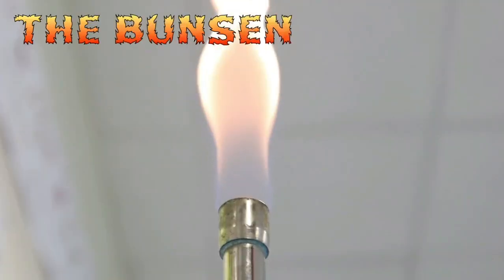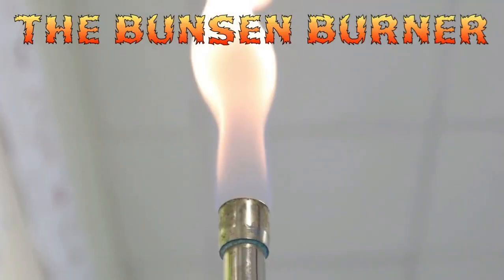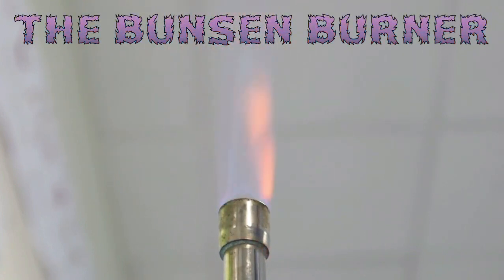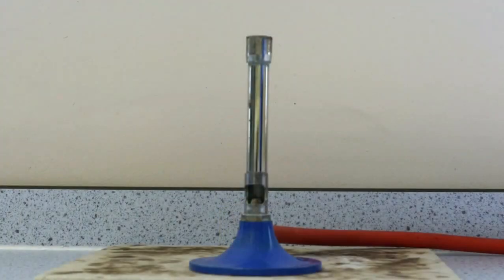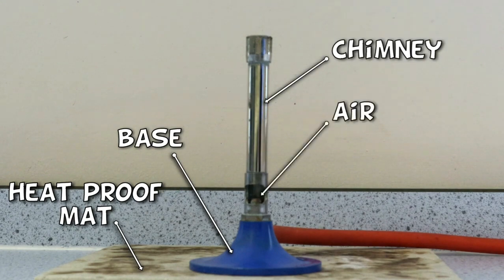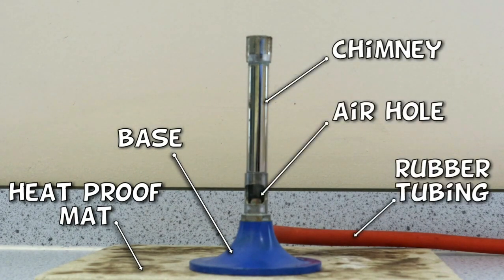Hi folks, in this video we're going to be taking a closer look at the Bunsen burner. It's the one piece of equipment that kids are keen to use when they start learning science in high school, and as a teacher it's something that we want them to learn to use safely. So here's the Bunsen burner sitting with its base on a heat-proof mat. This part is known as the chimney, this is the air hole, and this is the rubber tubing that connects the Bunsen burner to the gas tap.